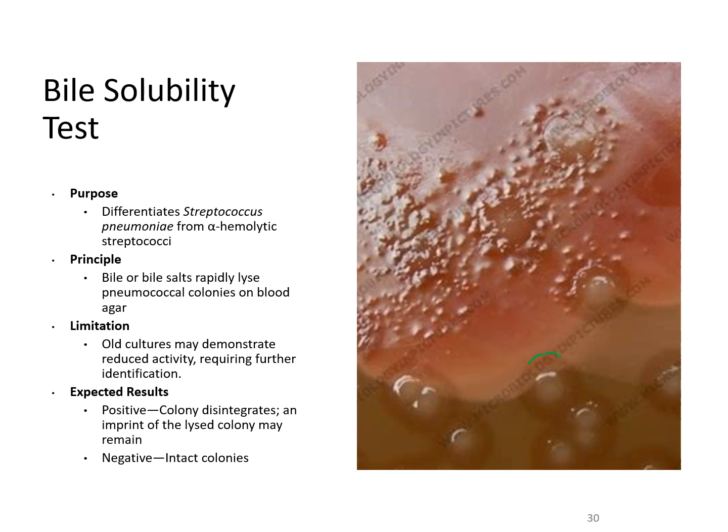Here you've got nice little colonies, and then that reagent has been dropped onto that colony plate. You can see the remnant of a few colonies where those colonies have been lysed by that reagent. As that colony disintegrates, it can leave an imprint of where that colony was. That would indicate a positive test.